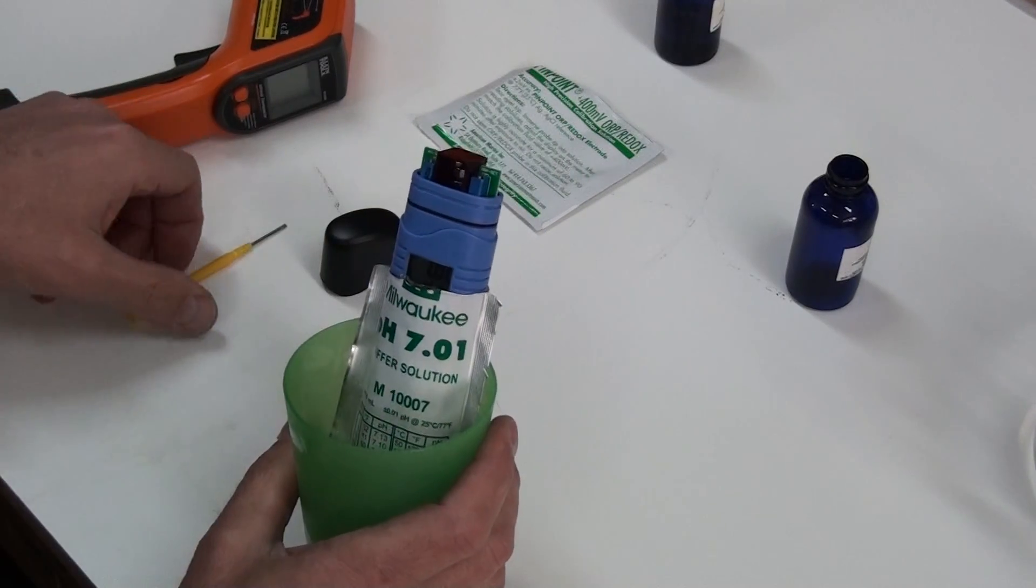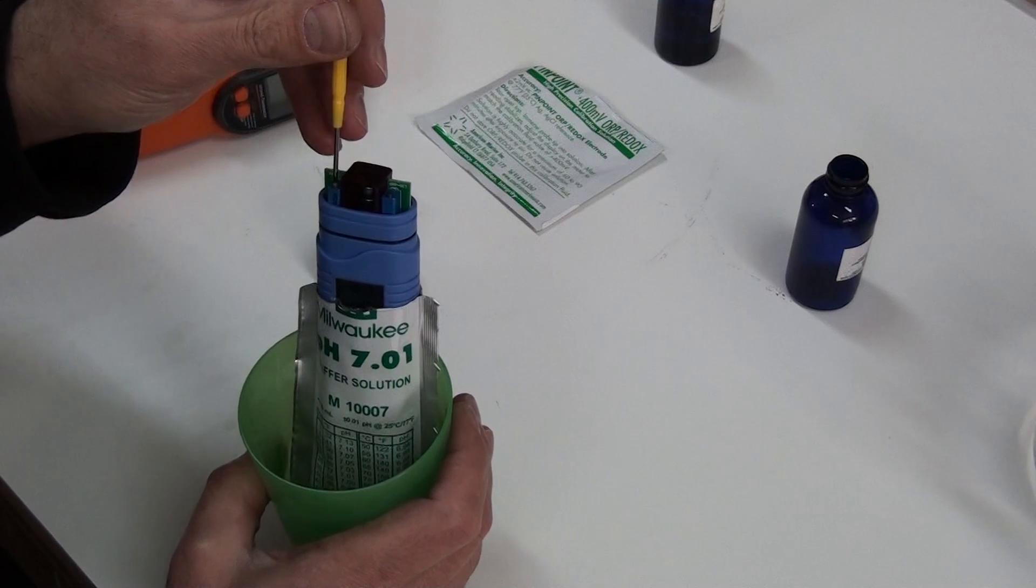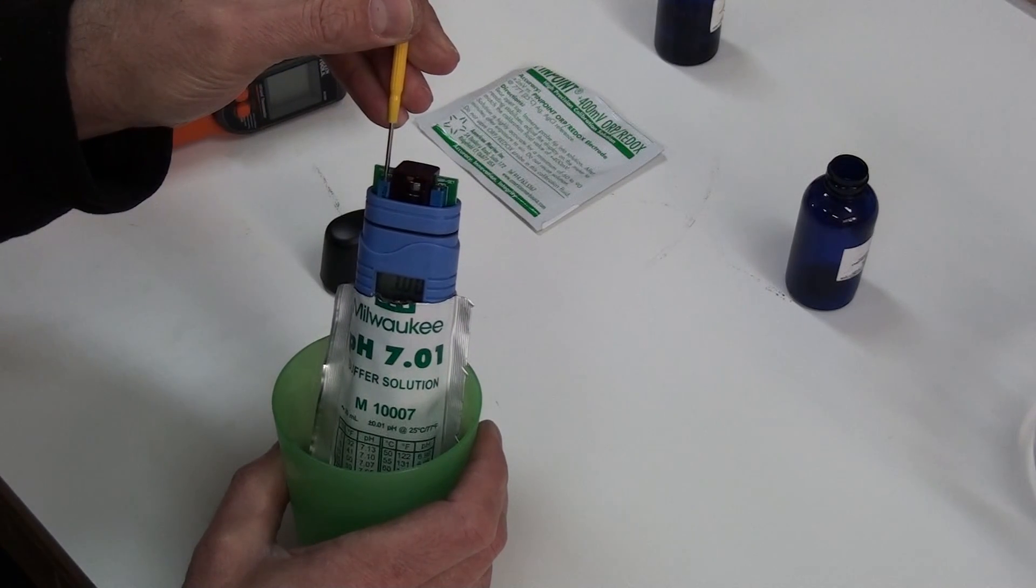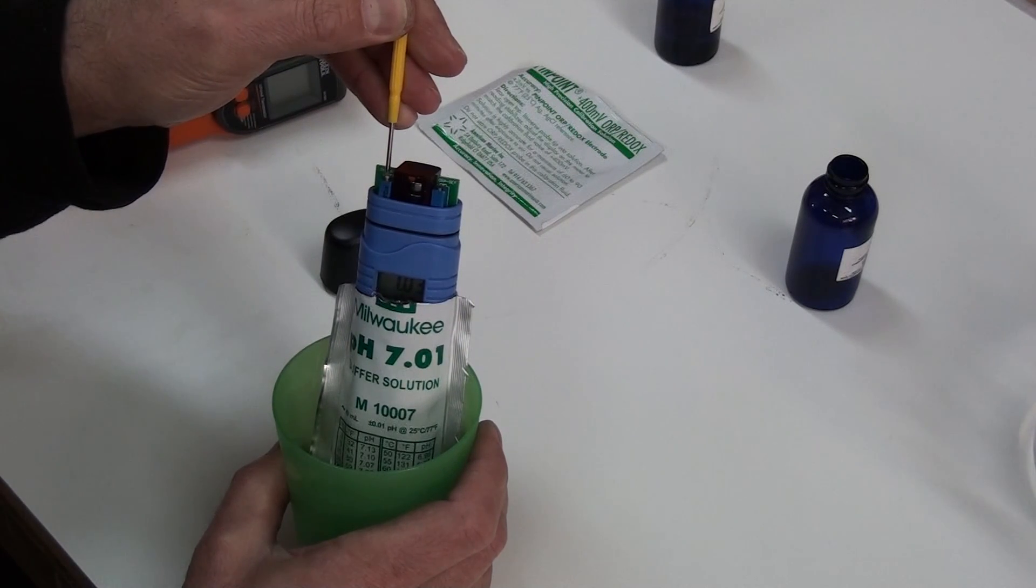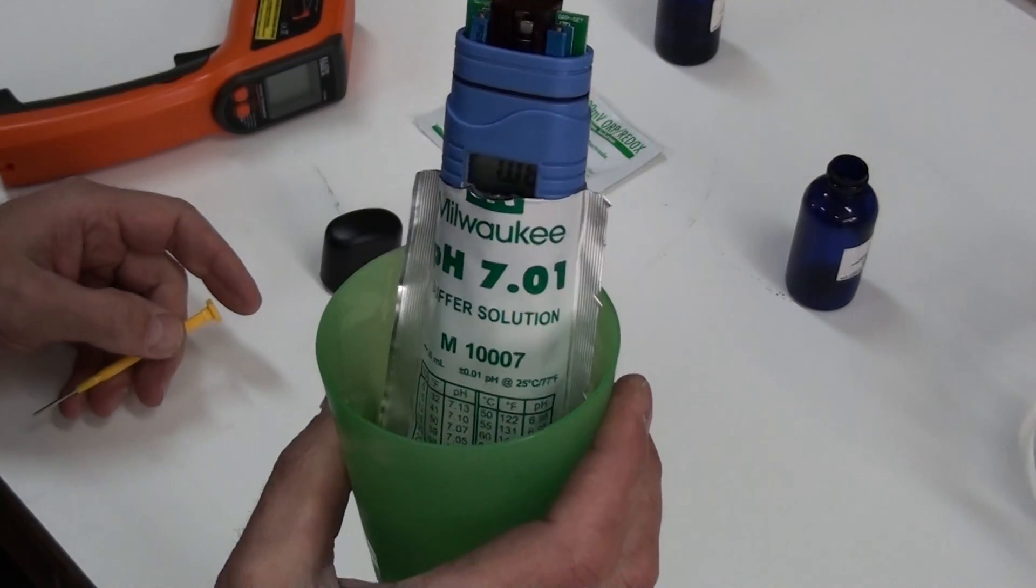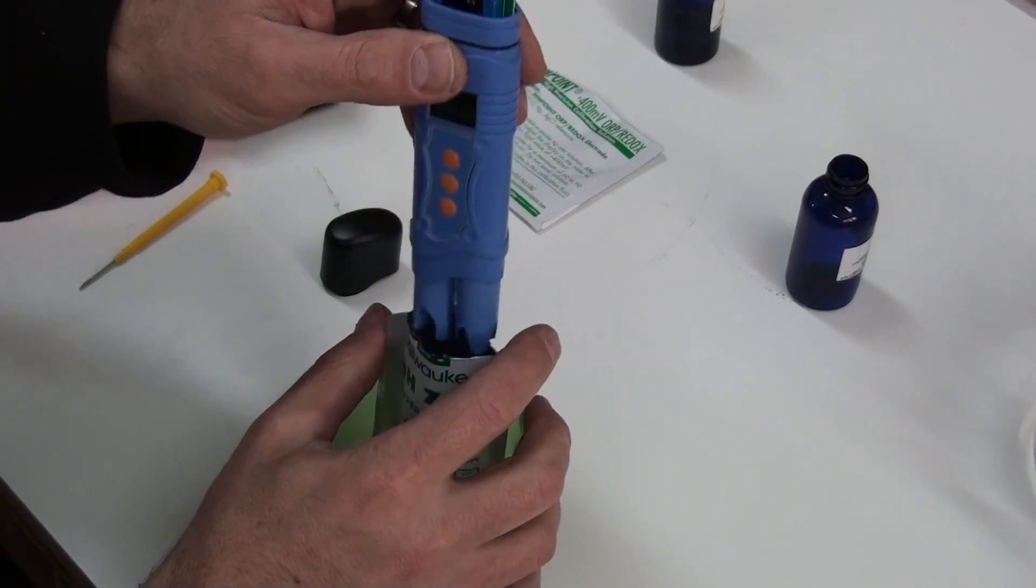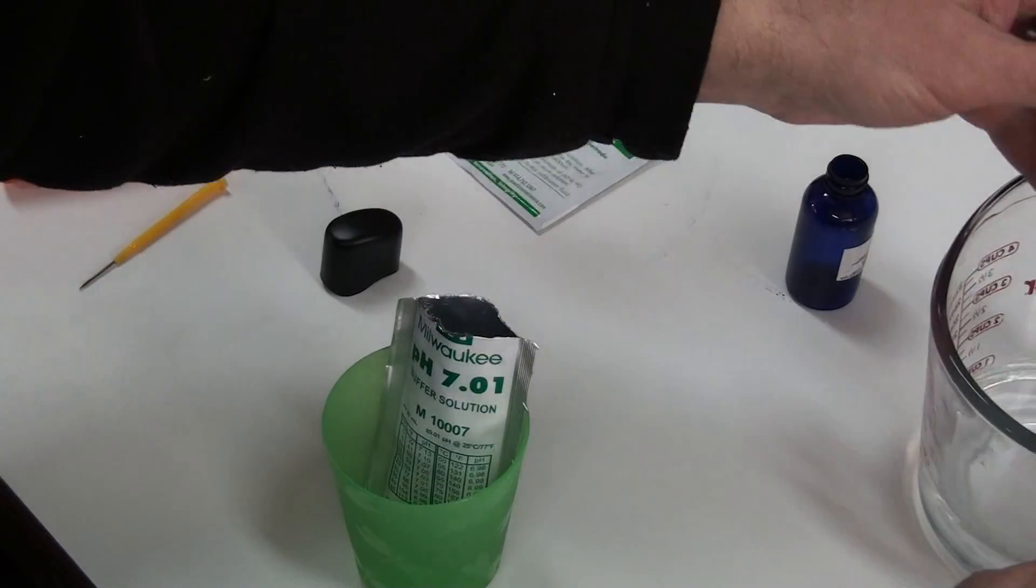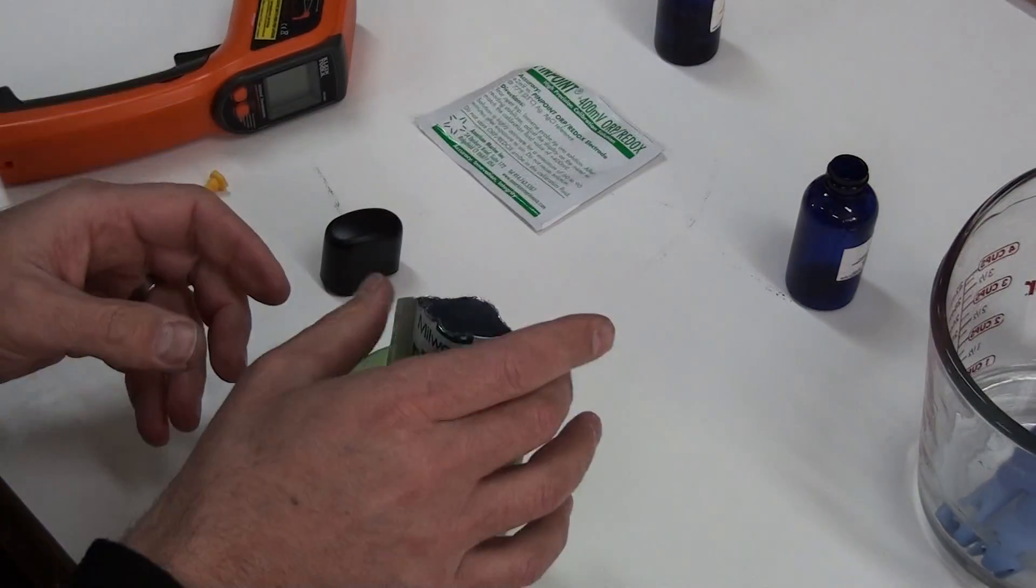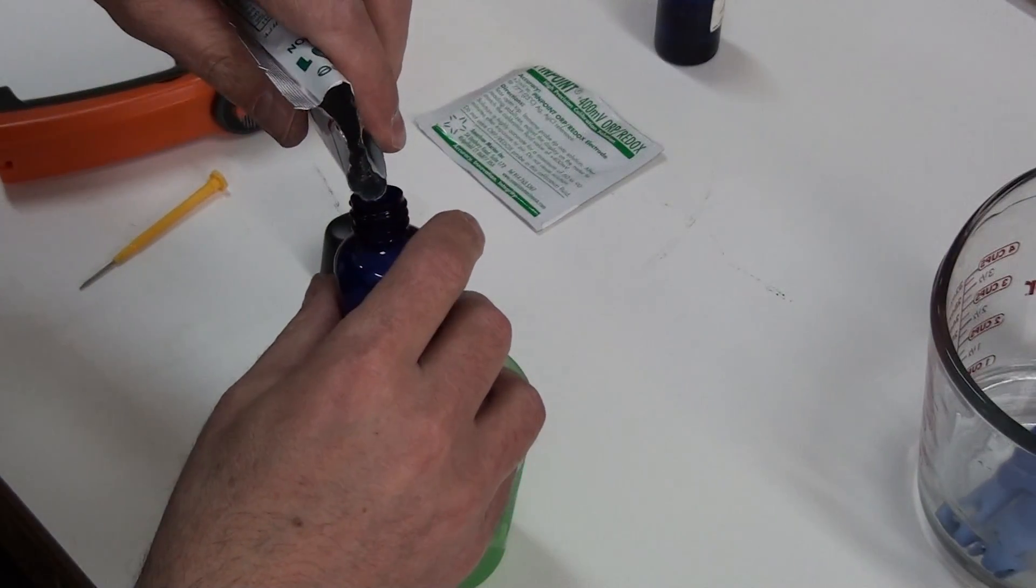It's showing 7 right now. So I will adjust this to 7.06. You can see it's at 7.06 and that's considered calibrated. We'll go ahead and wash this off in some distilled water. And pour this region back into the container so I could use it next time.